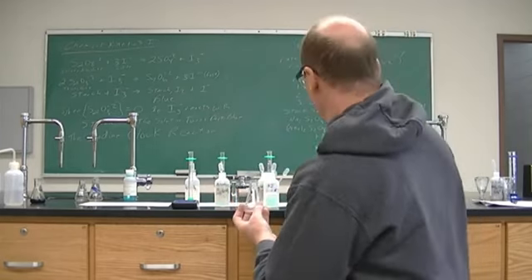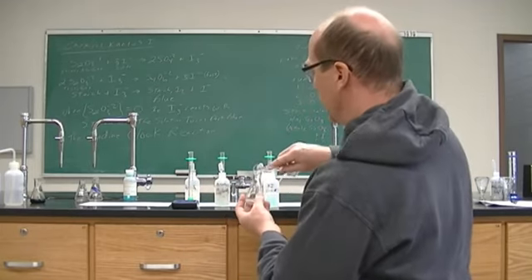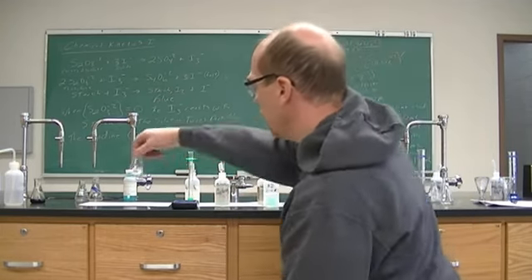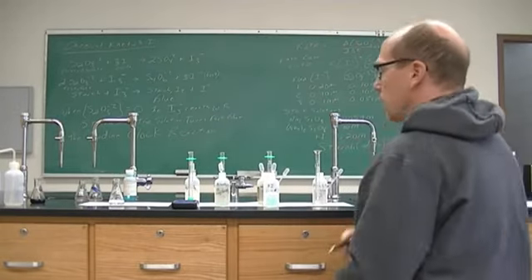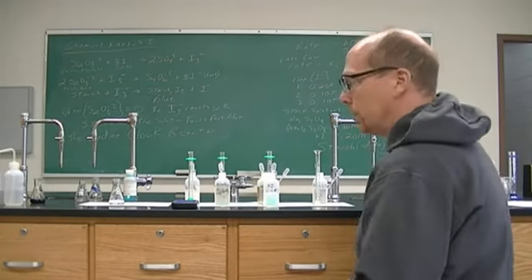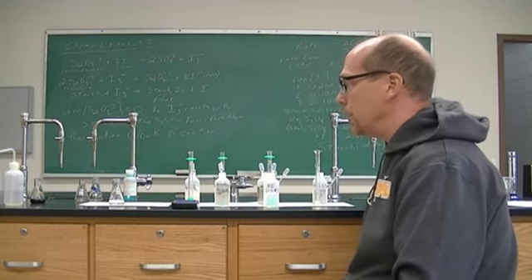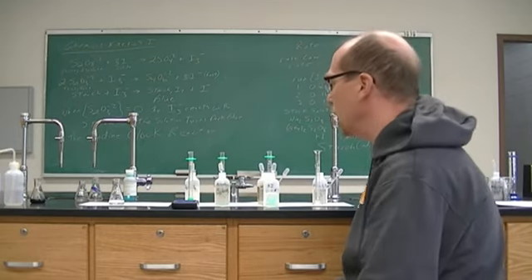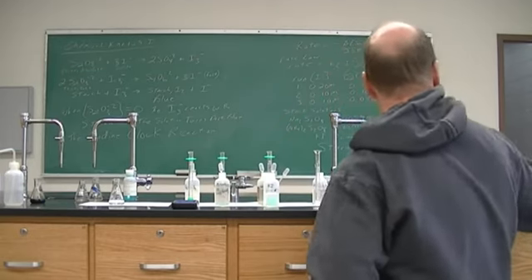And so I'm going to reset that, and I'm going to pour it in. I'm going to push go, give it a swirl, and let it set and wait until it turns blue. For our unknown, there are 2 runs in some of the experiments. We're just going to do it one time. Again, you're not going to be graded on the correct answer. It is just going to be graded on the calculation to find the concentration of your KI in this unknown solution.